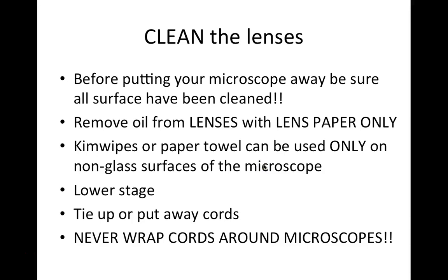Once you've viewed all your assigned slides, make sure you place your microscope in park. Clean all the lenses with lens paper; you can also use lens cleaner, which is like Windex for microscopes. Use Kim wipes and paper towel only on non-glass surfaces. Lower the stage, make sure the condenser is raised to its highest position, close the iris diaphragm, put away the cords, and never wrap a cord around the base of a microscope. Once your microscope is in park, it can go back in the microscope cabinet.